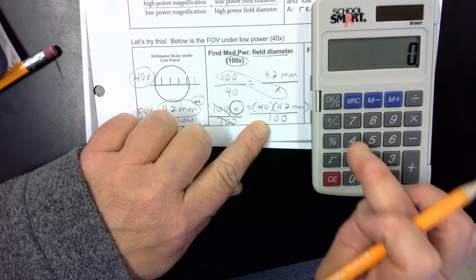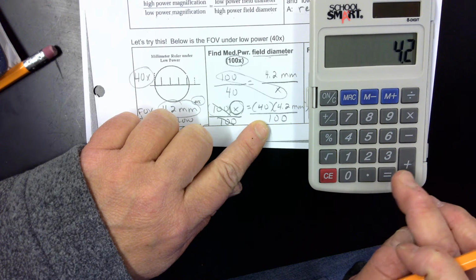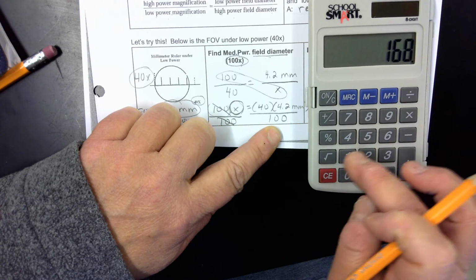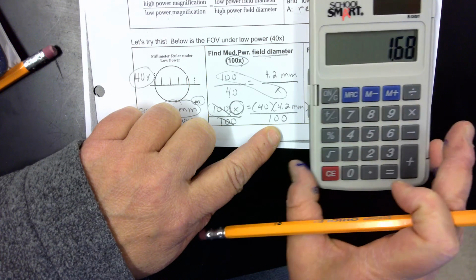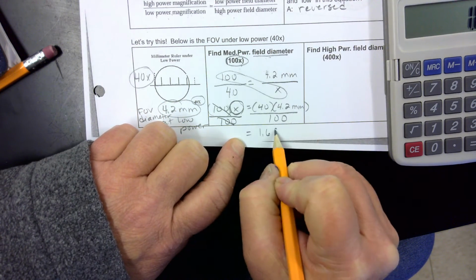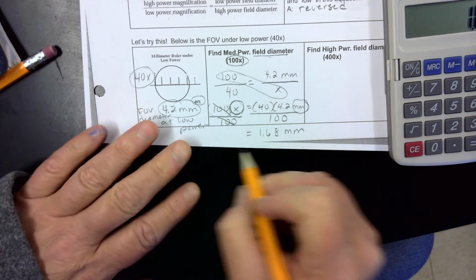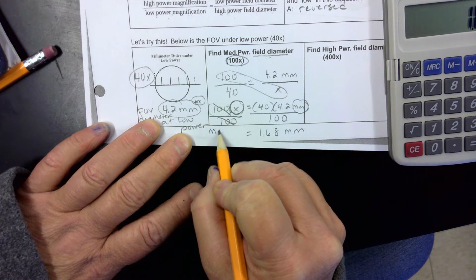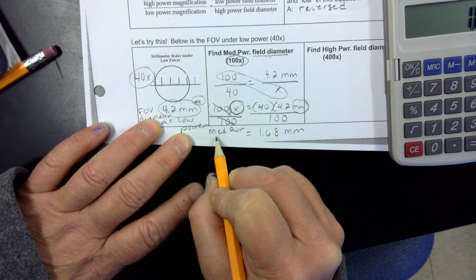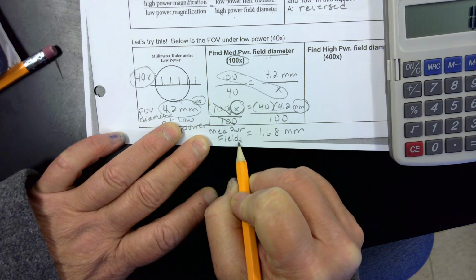So this is 40 times 4.2 equals, divide that by 100, and we get 1.68. So 1.68, notice this millimeters did not cancel, so that's our unit. So this is the medium power field diameter.